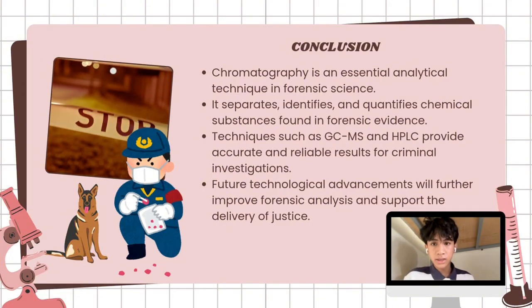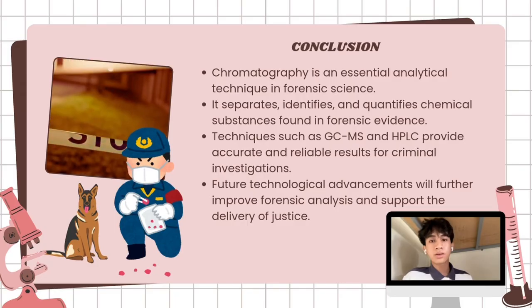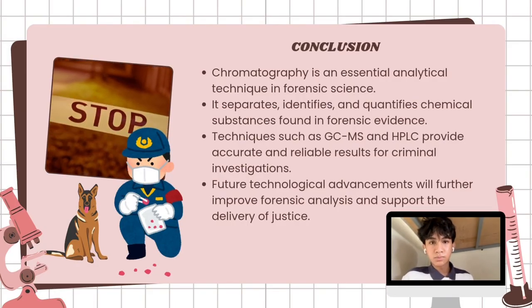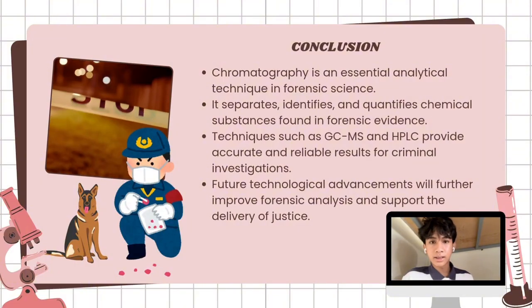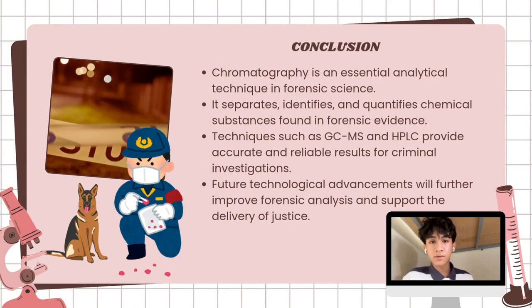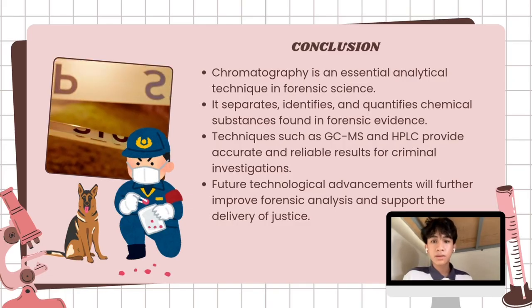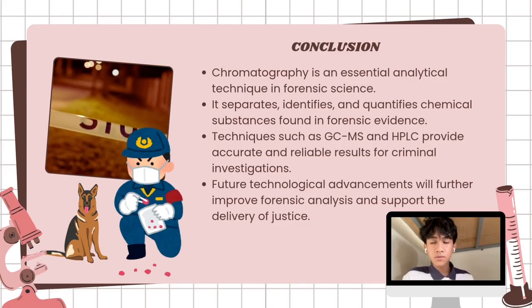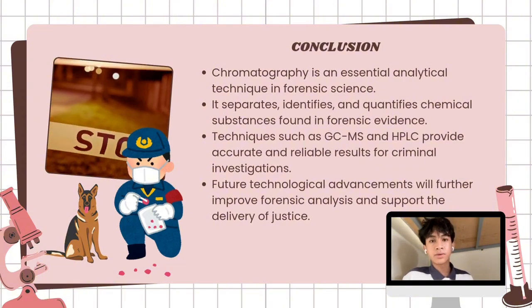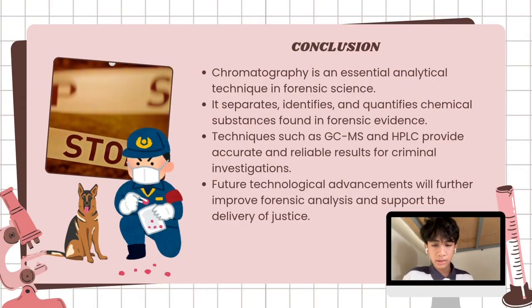So as the technology continues to develop, future improvements such as portable instruments and AI-assisted analysis are expected to make forensic chromatography even faster and more effective. So overall, chromatography will continue to be an essential tool in helping forensic scientists solve cases and support the justice system.